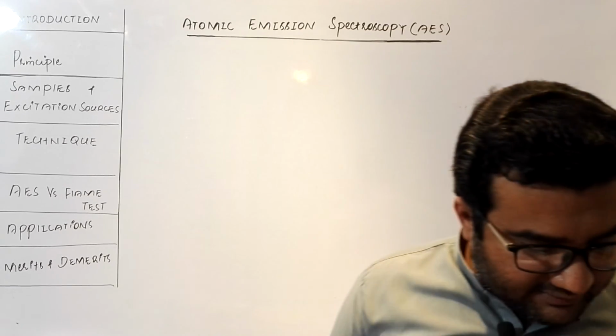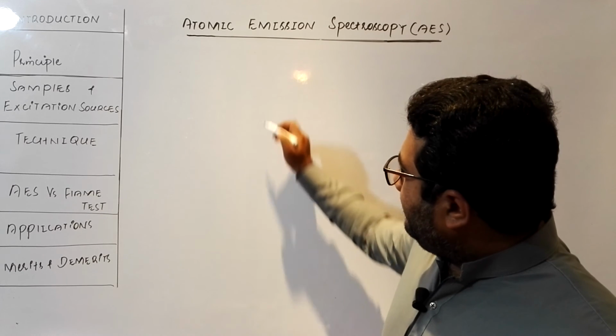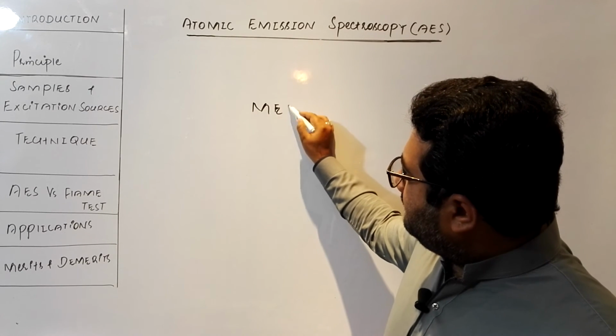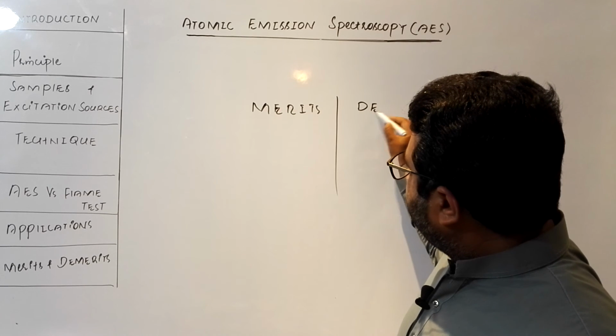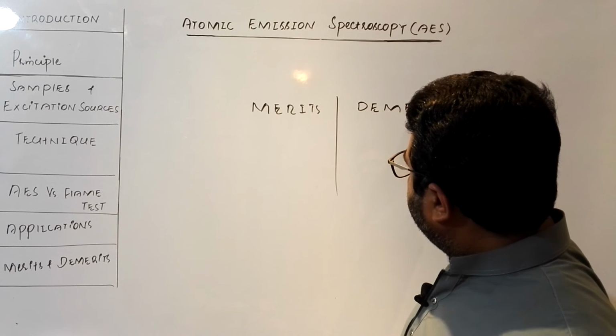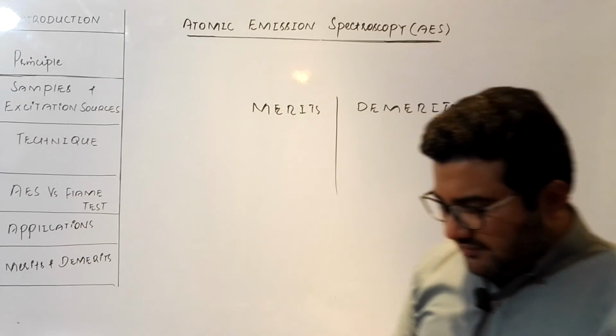And what are the merits and demerits of atomic emission spectroscopy? Merits versus demerits. What can be the merits?